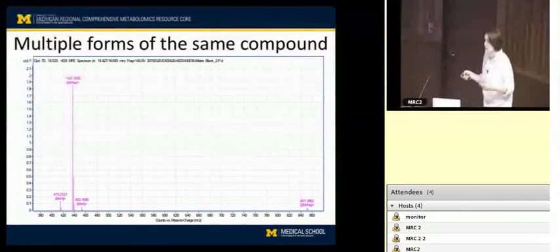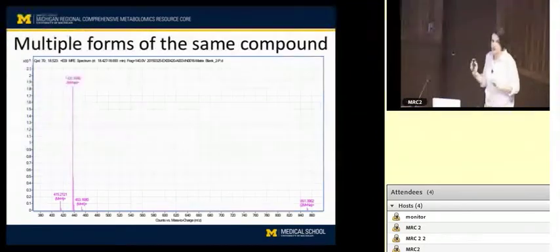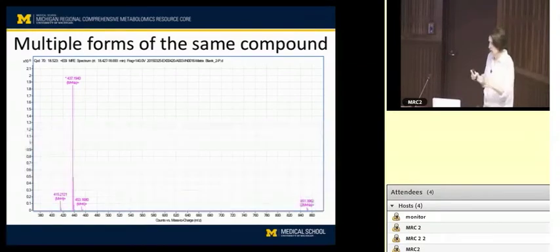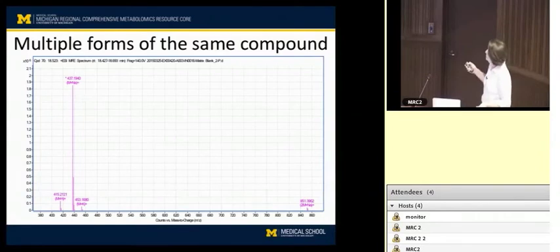This is an important point because in your untargeted metabolomics data, you have a lot of features that are related to each other that are all exactly co-eluting, and you want to try to reduce this down to one ion that best represents all of these ions here.